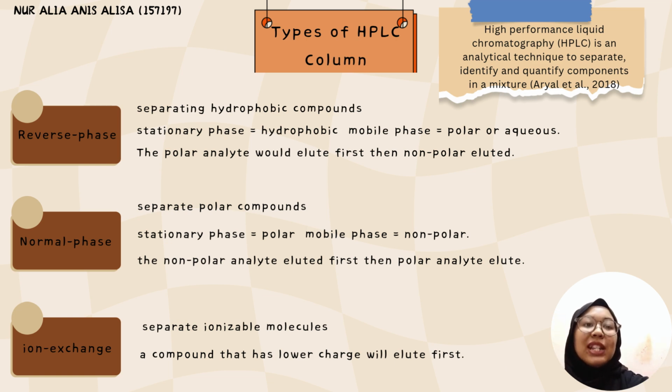First, reverse phase HPLC is for separating hydrophobic compounds. The stationary phase in reverse phase is hydrophobic, while the mobile phase is polar or aqueous. Reverse phase HPLC separates the mixture according to the polarity and hydrophobic characteristics. The polar analyte will be eluted first, then the non-polar will be eluted.